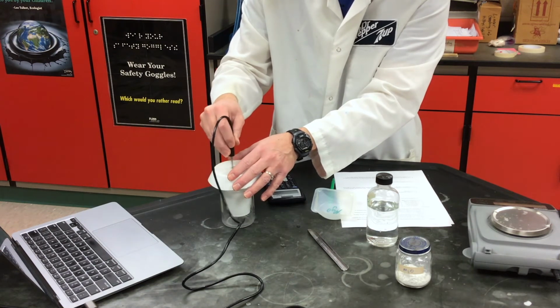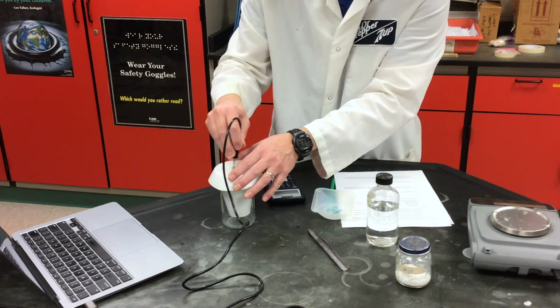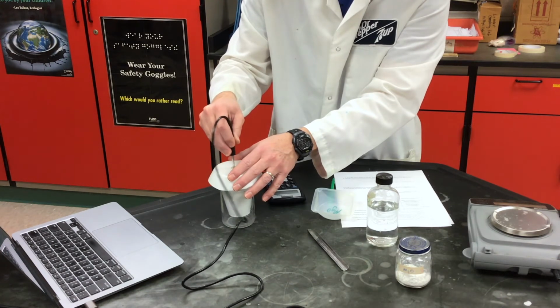22.6, and as long as it doesn't go up anymore, once it's very steady or even potentially goes back down, I'm at 22.7, then I will stop and record that as my final temperature.